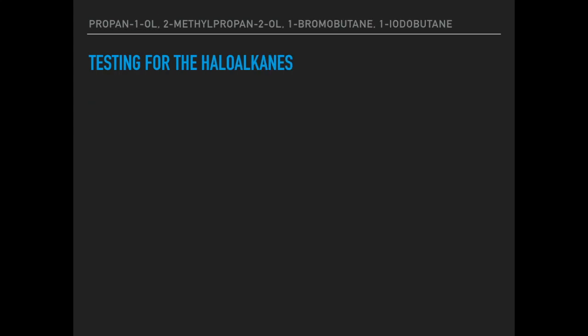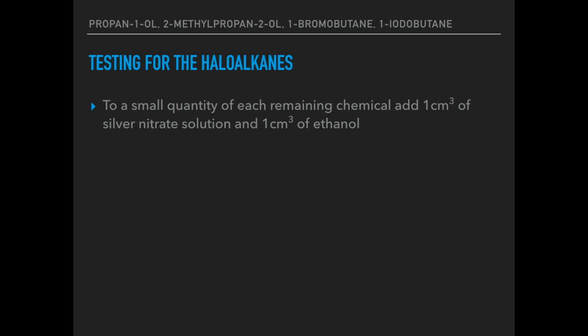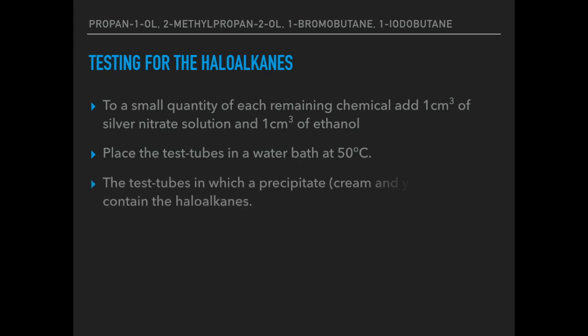The next test is for the haloalkanes — we've got two: 1-bromobutane and 1-iodobutane. To a small quantity of each of the remaining chemicals, add 1 cm³ of silver nitrate solution and 1 cm³ of ethanol. The role of the ethanol is to help the chemicals mix together, otherwise they would just form two separate layers. Place the test tubes in a water bath at 50°C. The test tubes in which a precipitate forms contain haloalkanes, giving a cream precipitate and a yellow precipitate.